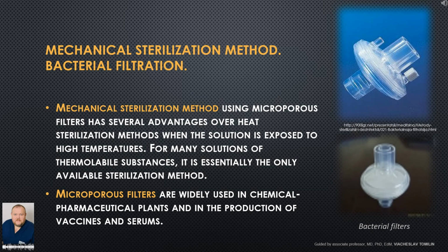Mechanical sterilization method using microporous filters has several advantages over heat sterilization methods when the solution is exposed to high temperatures. For many solutions of thermolabile substances, it is essentially the only available sterilization method. Microporous filters are widely used in chemical pharmaceutical plants and in the production of vaccines and serums.